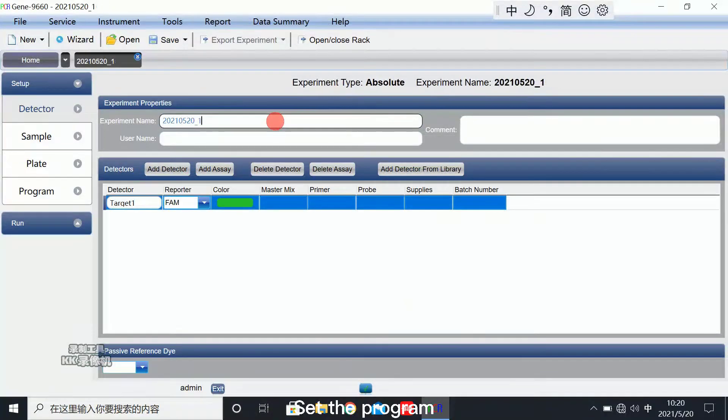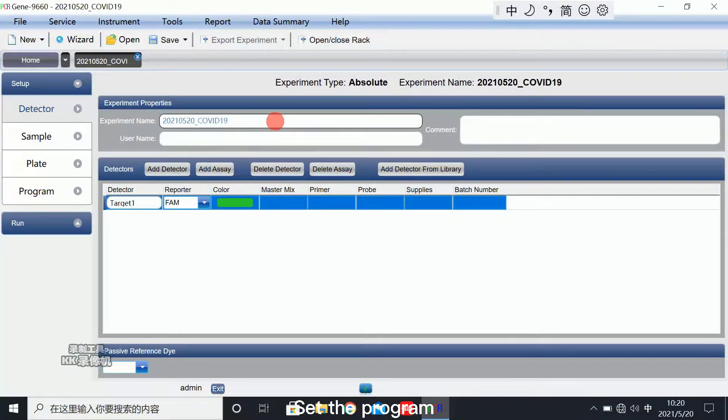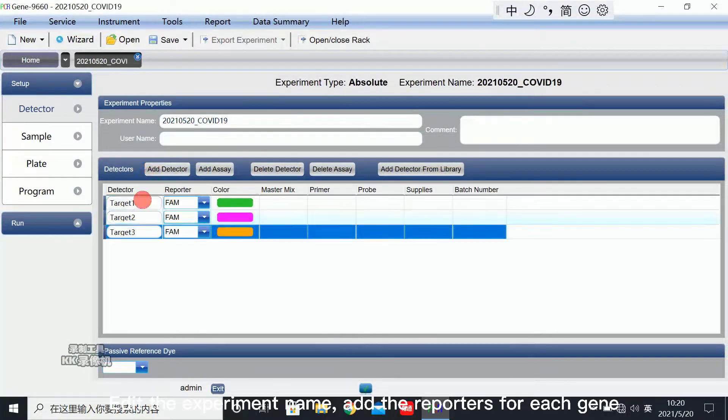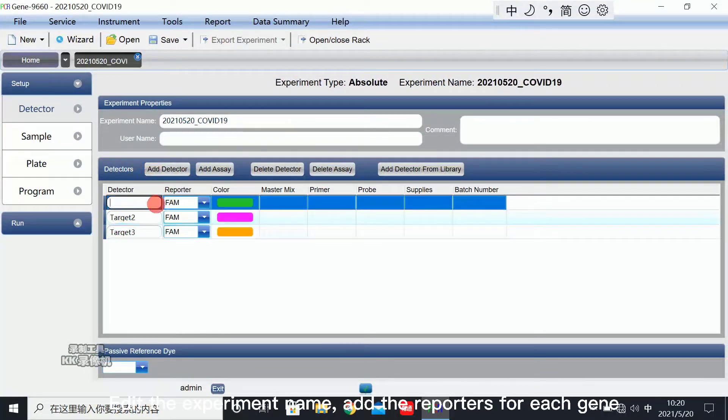Set the program. Add the experiment name. Add the reporters for each gene.